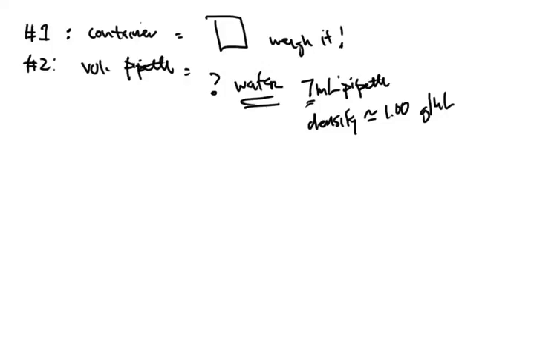So you won't really know what type of liquid that will give you on the day of the competition. We keep that a secret, but in practice version, to make sure that you're using the pipette the proper way, this is what we suggest.